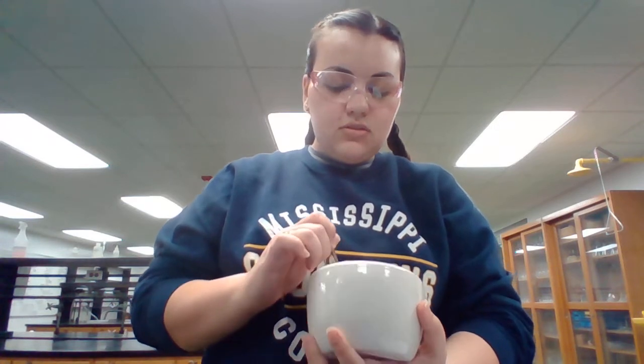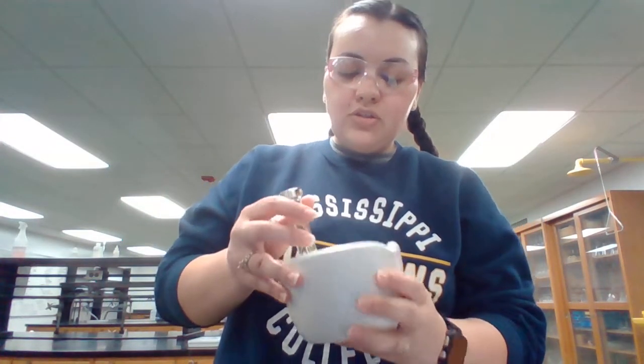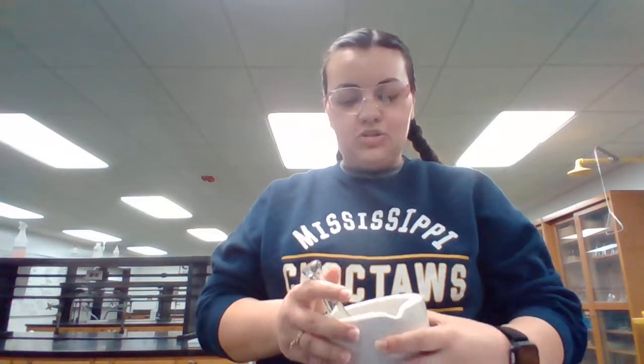Because we don't want every group to have to mash up their own sample, it would take a good bit of time. You can actually work with several other groups to grind up a large amount of the fertilizer, and then you can all take from the ground up sample and weigh your 1 gram from the same mortar and pestle, okay? And if you do it right, it should be a pretty fine powder. I'm not sure if you can actually see in there, there's some in there. But you'll still have some large chunks, and that's okay. Don't waste your time trying to grind down every single chunk of fertilizer. Some of them are not easy to grind.